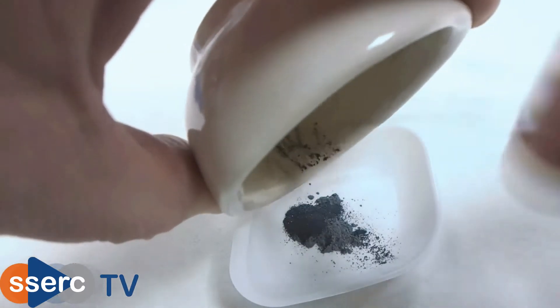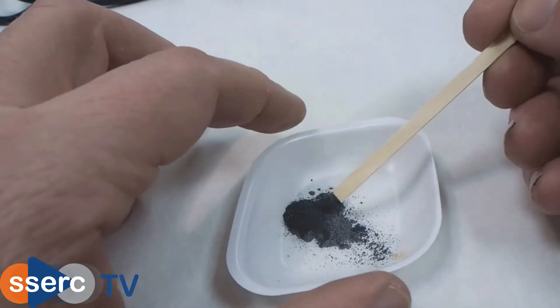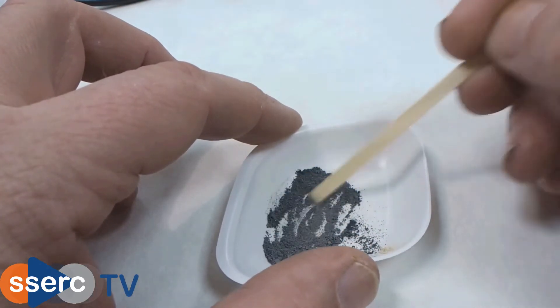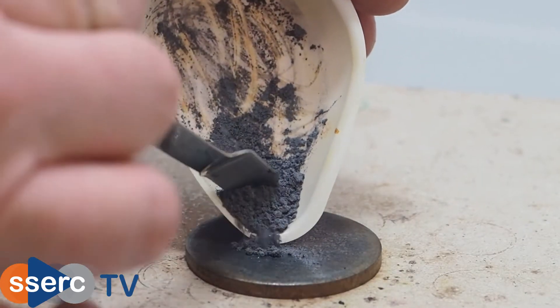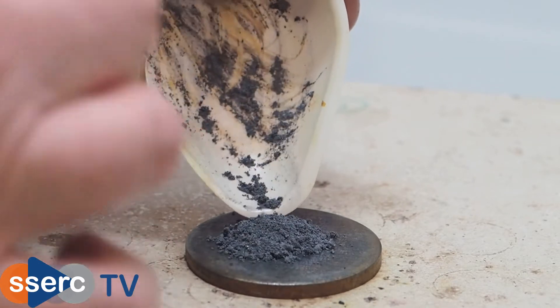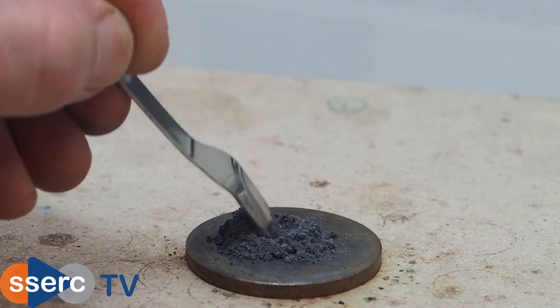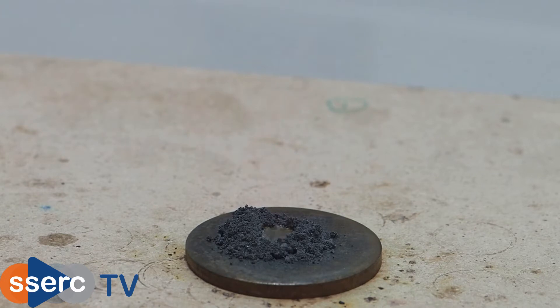The reaction produces hazardous fumes of iodine, so should be carried out in a fume cupboard, although there is an alternative that I'll come to later. Put your aluminium-iodine mixture onto a non-flammable surface and make a small dent in the top. Now put a couple of drops of water into the dip you made in the pile. It helps if the water has a little detergent in it to help it mix.